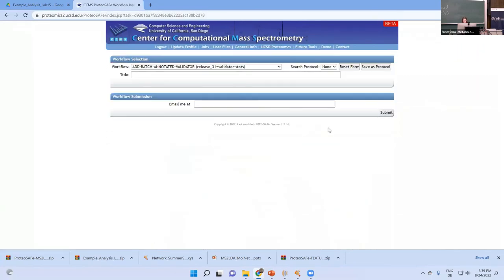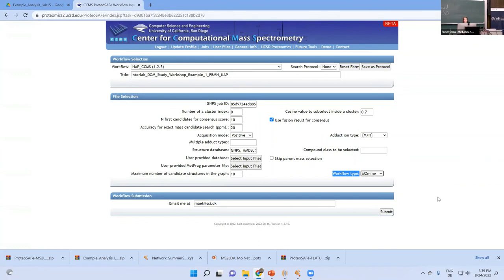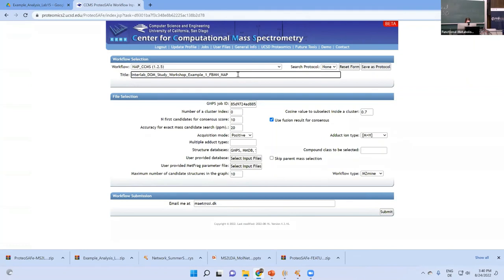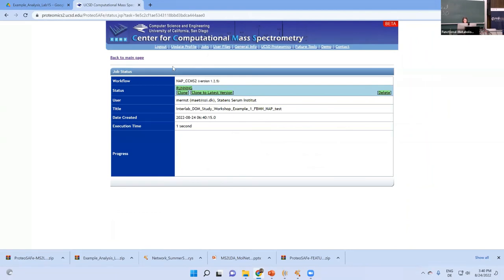Another issue: for the workflow type, you need to select MZMINE. This specifies that the data formats and your feature-based molecular networking job come from an MZmine preprocessing output — the algorithm needs to know that. Then everything should hopefully work. For running MolNet Enhancer on your own data, you need to wait until NAP is finished, which will take several hours — so you will probably have to run MolNet Enhancer on your own data tomorrow.